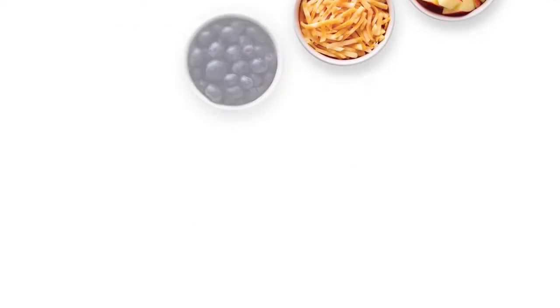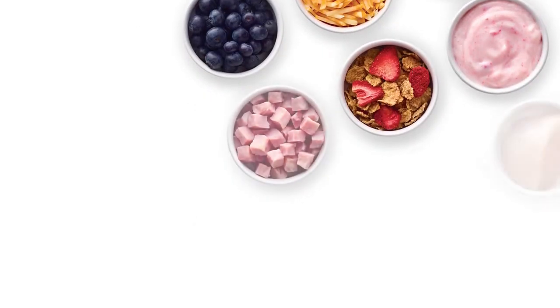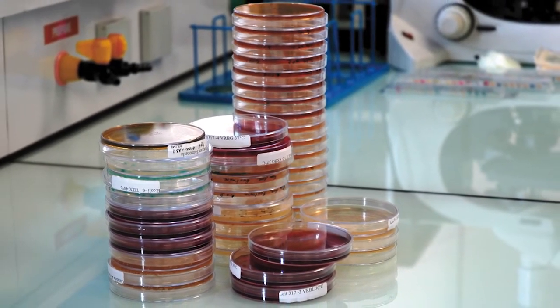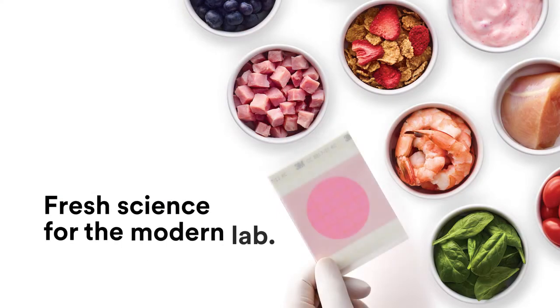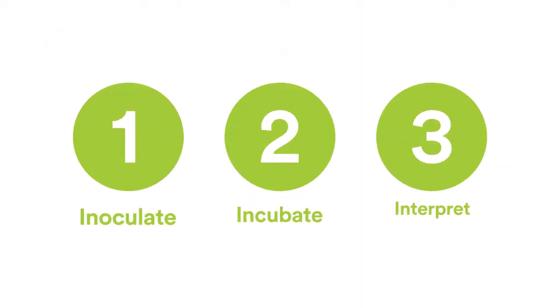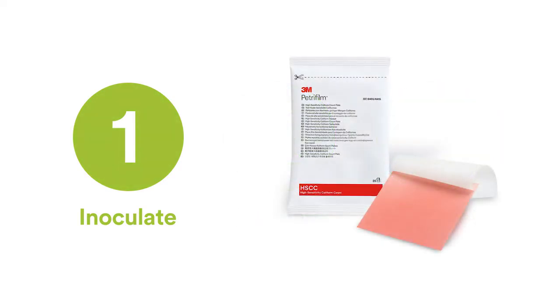If you're involved in food safety, you know that the landscape here is continuously changing. Old methods requiring media preparation before use are going by the wayside. Today there's fresh science for the modern lab from 3M Petrifilm plates. With 3M Petrifilm plates, there are just three simple steps to getting consistent, reliable test results.